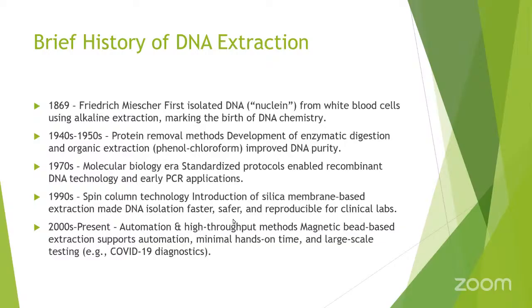From the year 2000 to present, automation and high-throughput methods, magnetic bead-based extraction, support automation, minimal hands-on time, and larger scale testing, for example, the COVID-19 pandemic diagnostics.